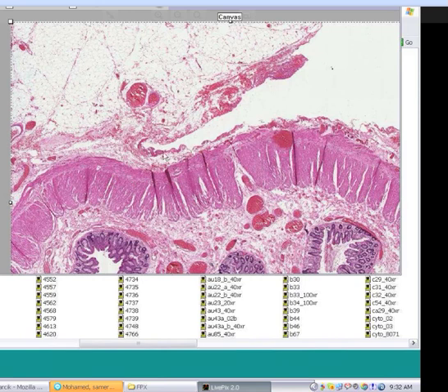And then you look at the outside, the loose connective tissue. If you think you see some mesothelial cells surrounding the outermost layer, then this is probably something intraperitoneal, like small bowel or half of the large bowel, rather than retroperitoneal, in which you would only see connective tissue and no mesothelial cells. Folks, that is the algorithm.